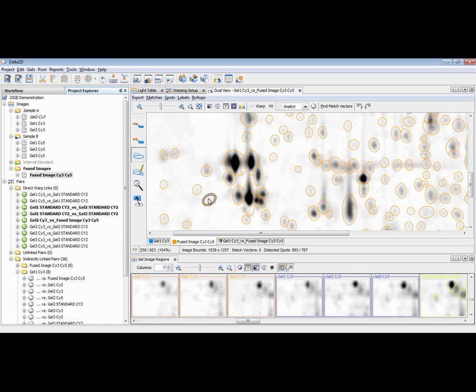So to now make sure that there are only relevant spots on the fused image, you have to keep in mind that on the fused image each spot is appearing with its highest intensity across all the other images. And if it's weak on this image, it shouldn't be stronger on any of the other images. So you can almost be sure that if you delete a weak spot here, that you haven't cancelled a stronger spot on the other images then. So let us find out how to find a benchmark for weakness of spots.